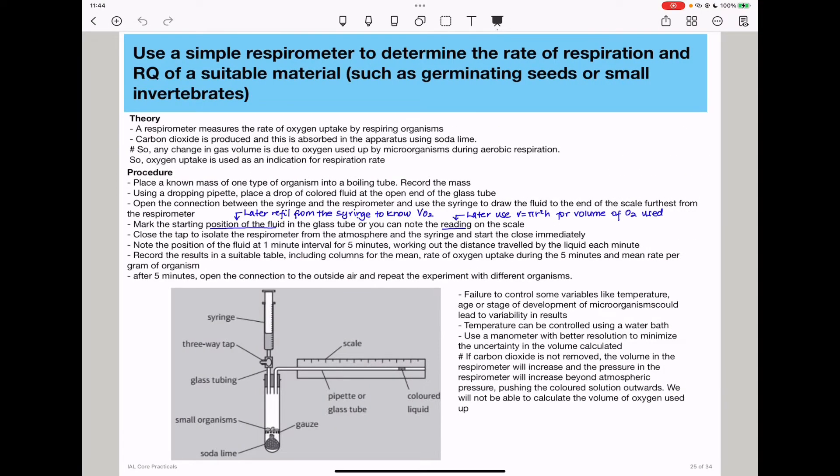So here the theory is, a respirometer is used to measure the rate of oxygen uptake by respiring organisms. Of course, because during respiration, oxygen is taken up and CO2 is produced, so the produced CO2 is going to be absorbed by the soda lime.